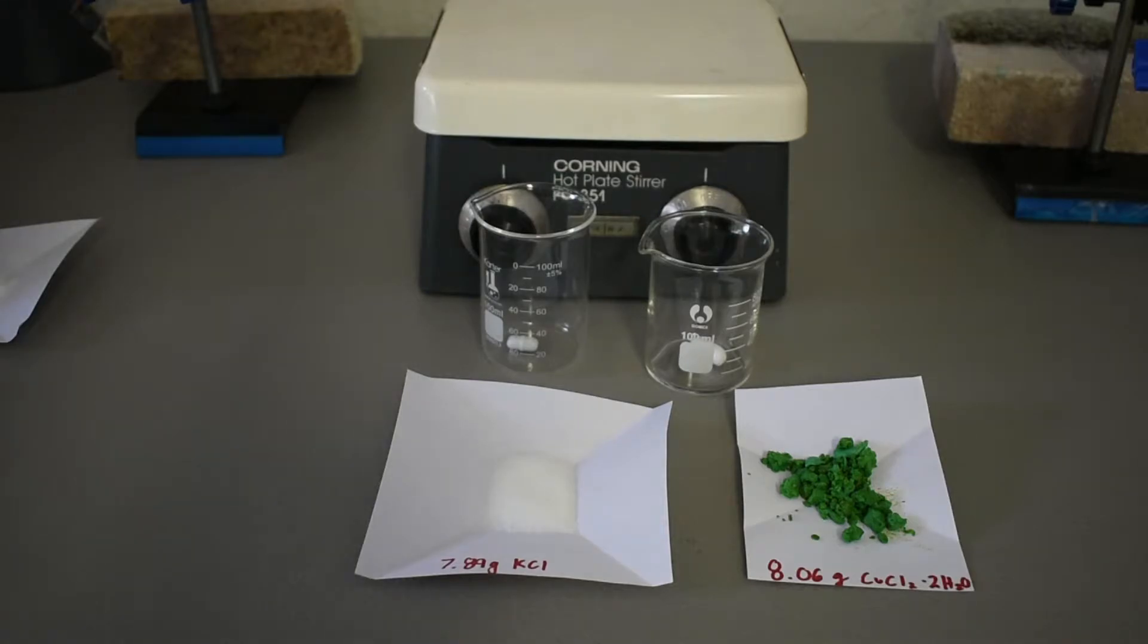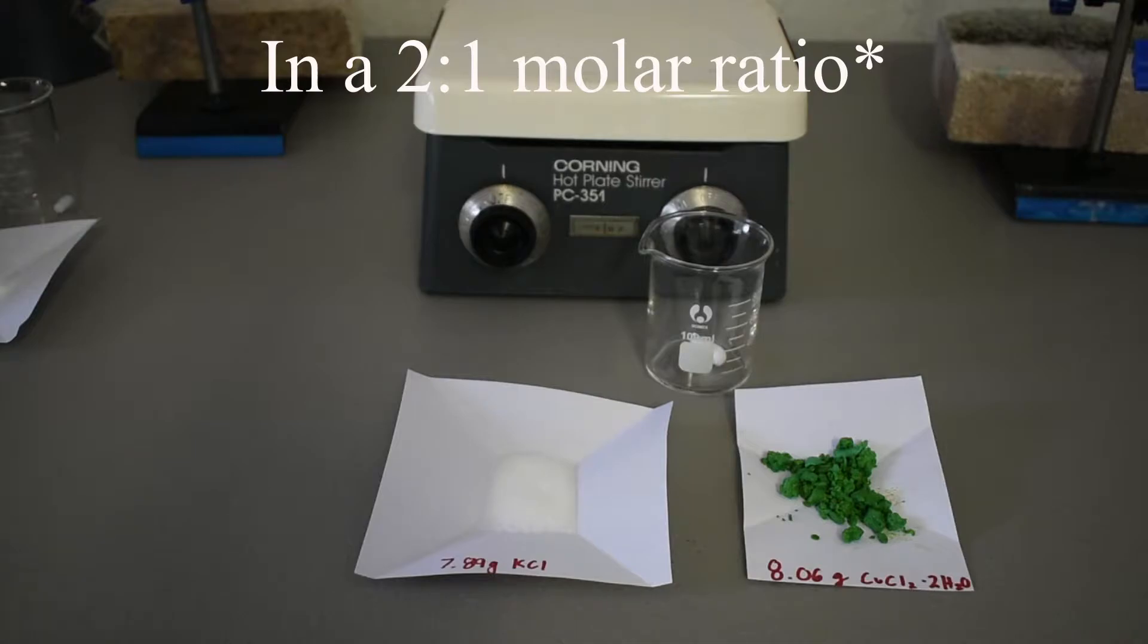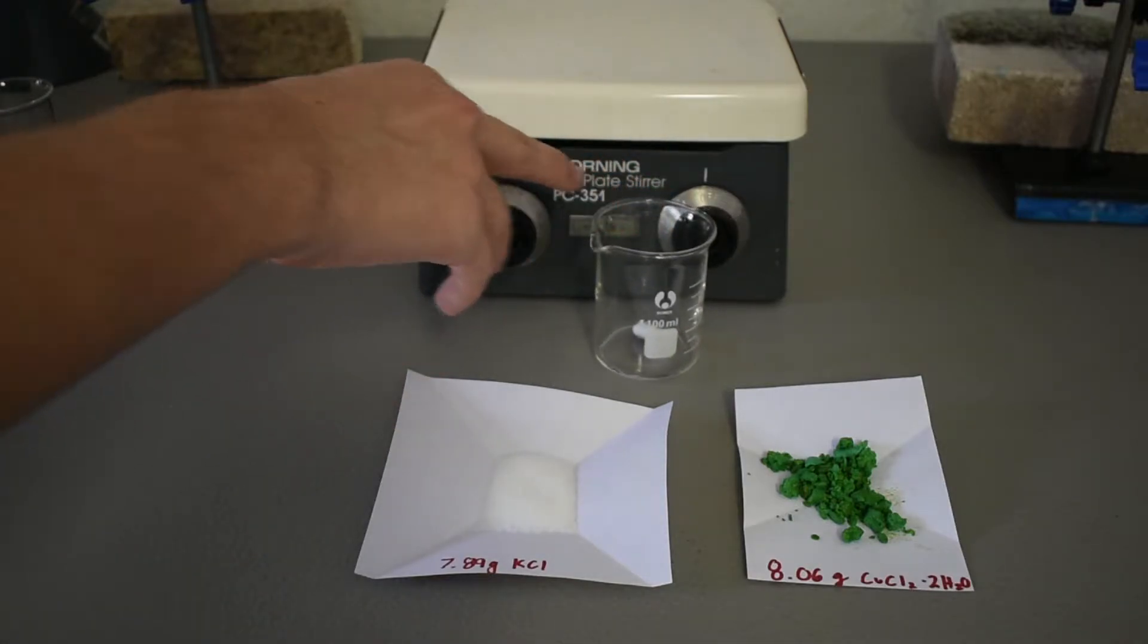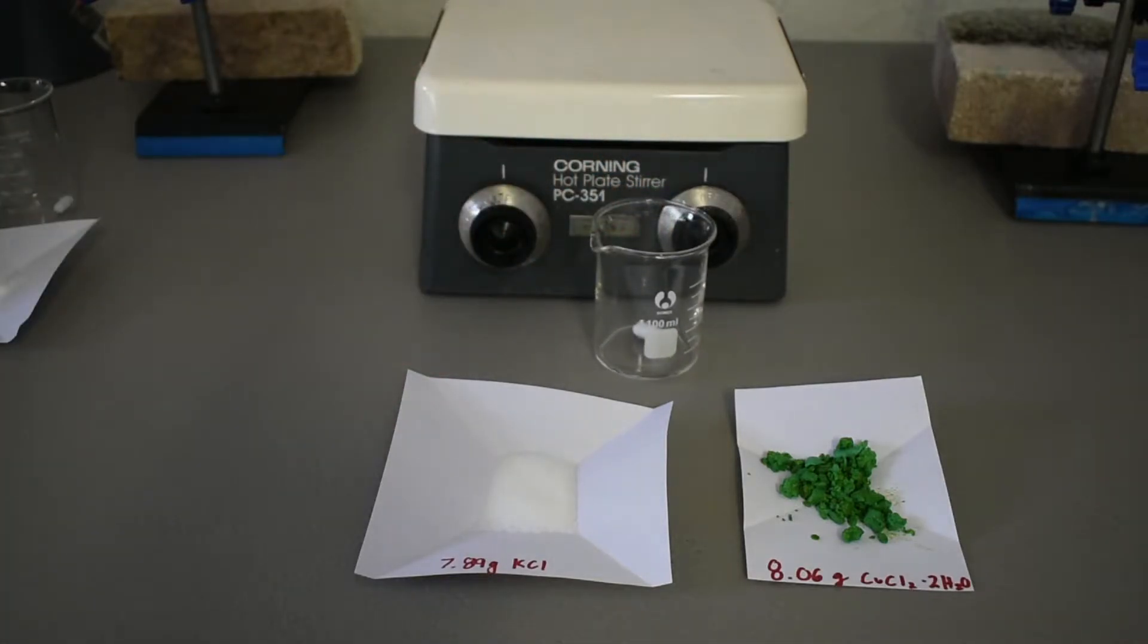I'm doing this on a scale where I should get about 15 grams of the potassium tetrachlorocuprate, so you're going to need 7.89 grams of potassium chloride and 8.06 grams of copper chloride dihydrate. And the preparation is actually very simple. All you have to do is combine these in aqueous solution, and then evaporate it slowly, and you'll get some nice crystals. Now the potassium salt is more of a light green, and the ammonium salt is more of a cyan bluey color.